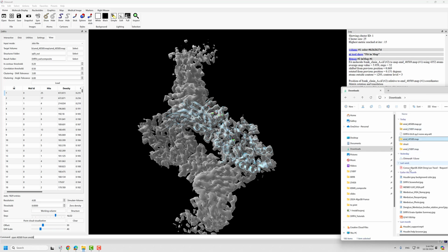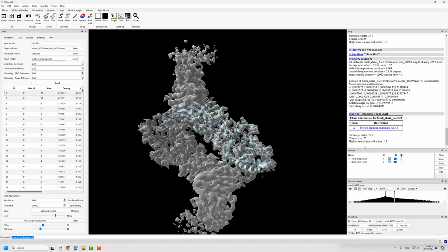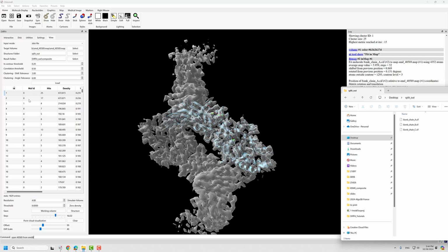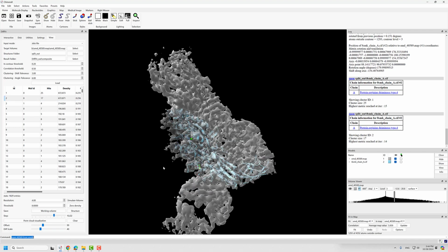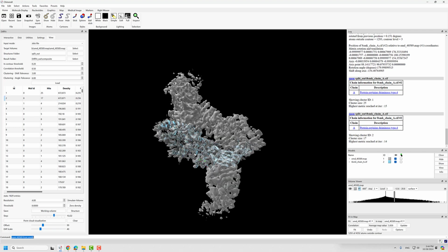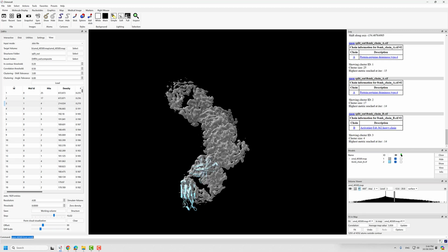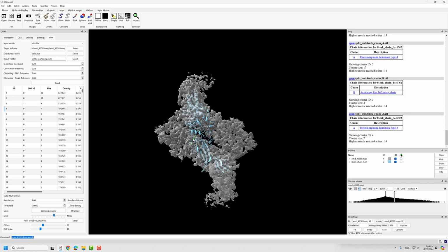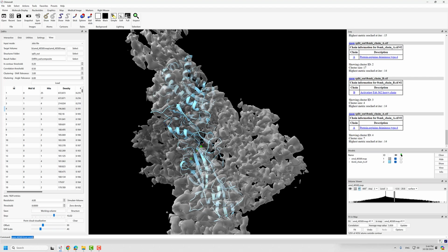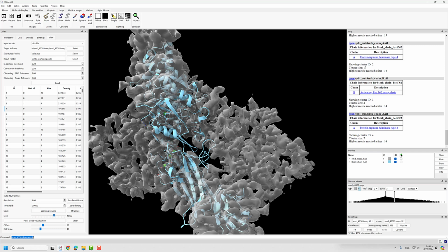Here, in the desktop, and it also shows the file's name here. Later on, we will show the file name here in the table as well. And you can see there are 2 occurrences of the first structure, and we also find a placement of a smaller subunit here. And then these, of course, you can see this doesn't make sense because it doesn't follow the map.